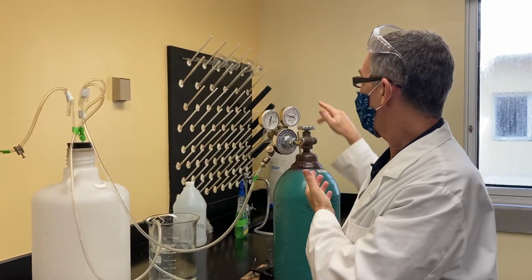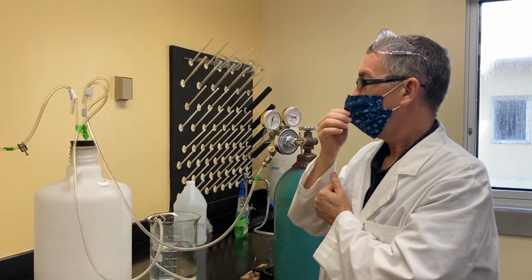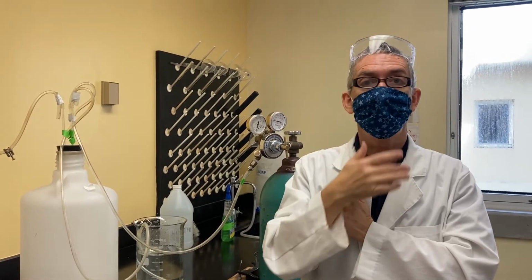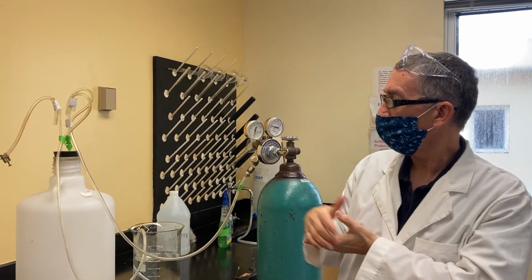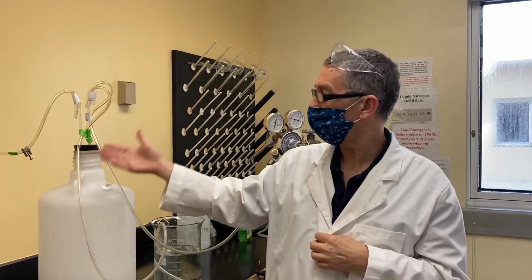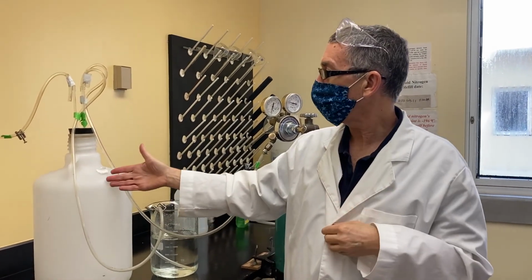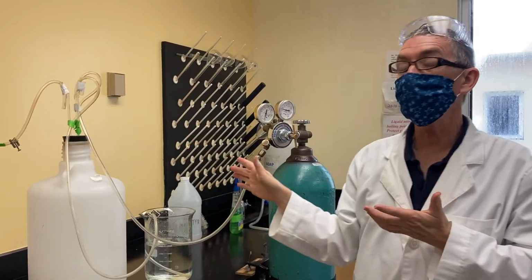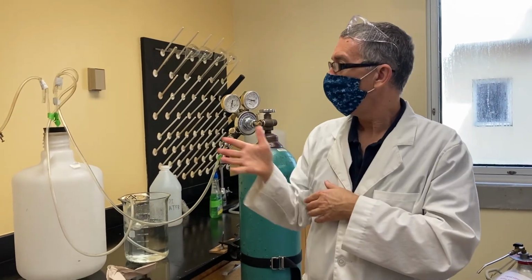You'll finish this by closing off the gas here, and you'll do a second run. In fact, you should do 5 runs on each gas. Exactly what we just did. On the subsequent runs, the purging time can be just 5 minutes. You don't need 15 because this is now almost pure argon with very little air mixed in, just maybe perhaps some from raising and lowering. I recommend doing that 4 more times and you have 5 data points.